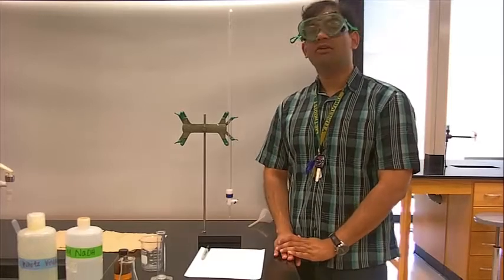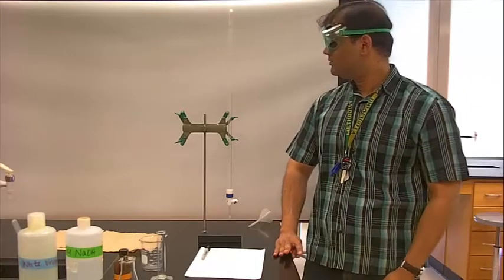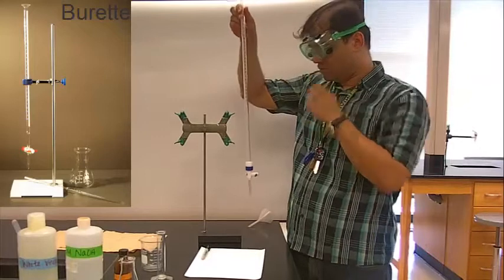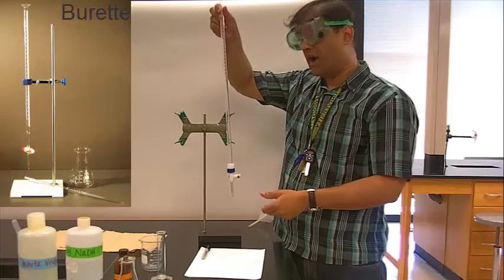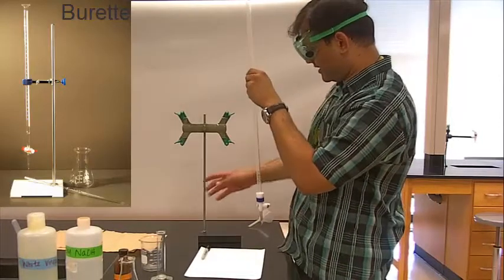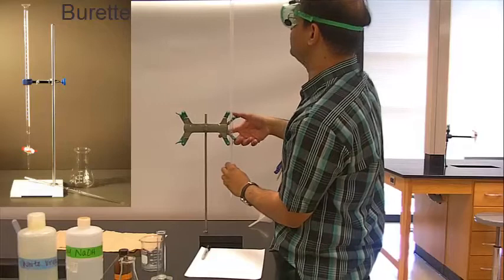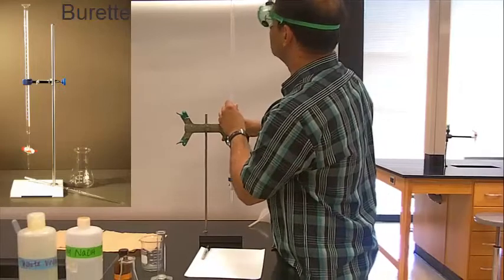So class, in this experiment, you'll be performing a titration. And in order to do a proper titration, you need to get familiar with this type of glassware. It's known as a burette. It's a long, elongated tube of glass, and there's a little spigot here that you can turn on or off, and volume will dispense. So you hold this and you're going to get this clamp. Hold the two clamps together, put it in here, and now the burette is set and stable. So work with your partner, make sure you are all good in how this is arranged.